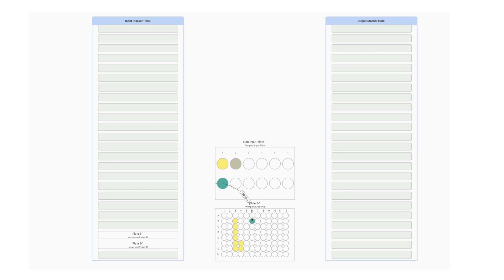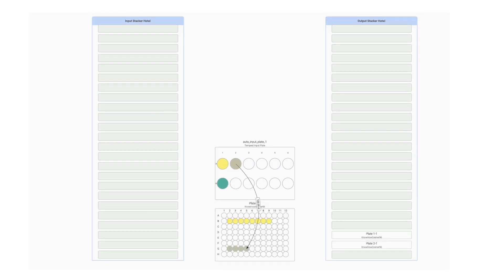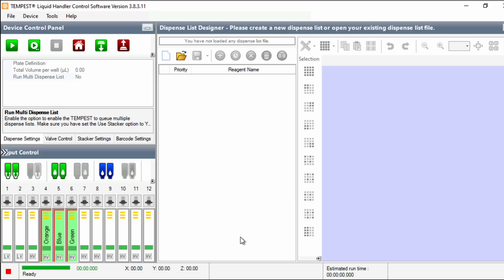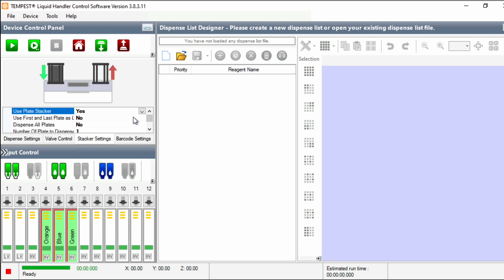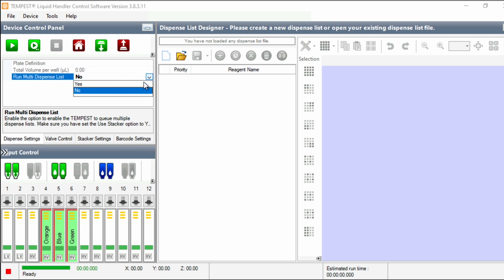In the Synthase workflow we made earlier, we chose to dispense onto three plates using the plate stacker, so first we'll need to enable the plate stacker. Go to the Stacker Settings tab and select Yes from the dropdown. Then back on the Dispense Settings tab, next to Run Multi Dispense List, select Yes from the dropdown.